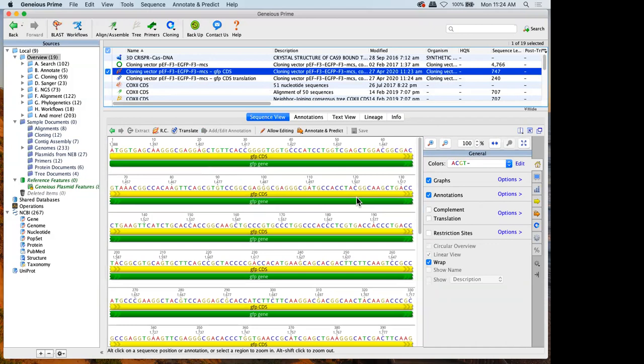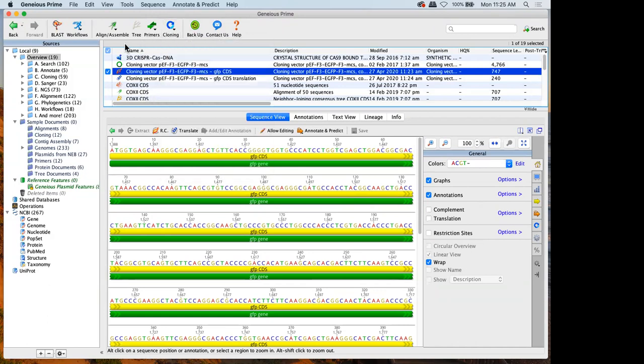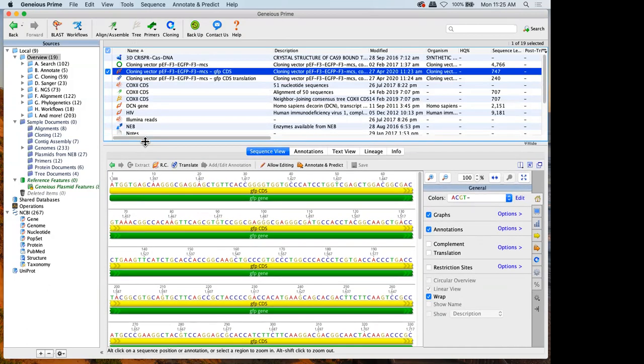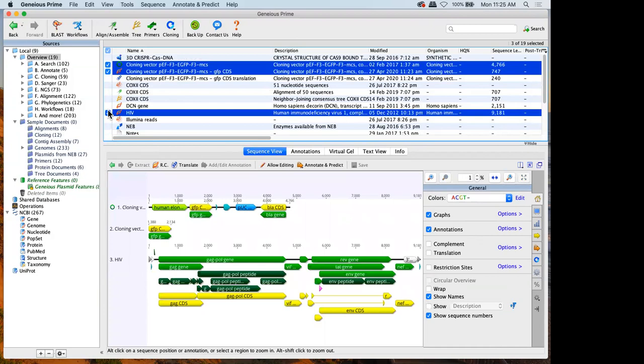And then to run any analyses in Geneious, the way it generally works is that you select the sequences or the data you want to work with, and then you select the operation. And these are all across the top. So for example, I could select my sequence and go design primers, or I could do cloning. You'll notice some options are grayed out, like my tree button's grayed out. That's because you can't make a tree on one sequence. You'll notice the minute I pick 3 sequences, that's the minimum you need to make a meaningful tree. That's when the tree button becomes enabled.